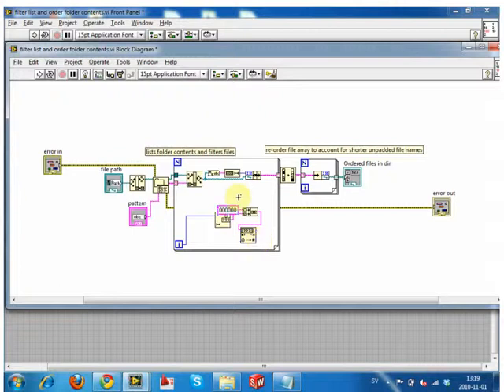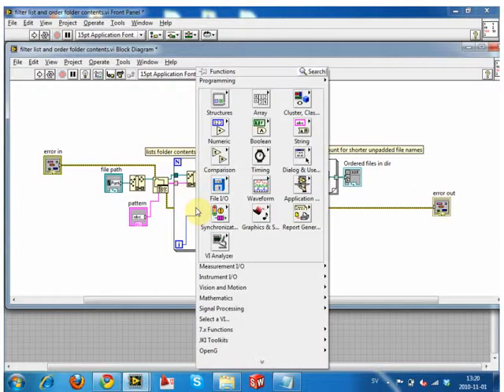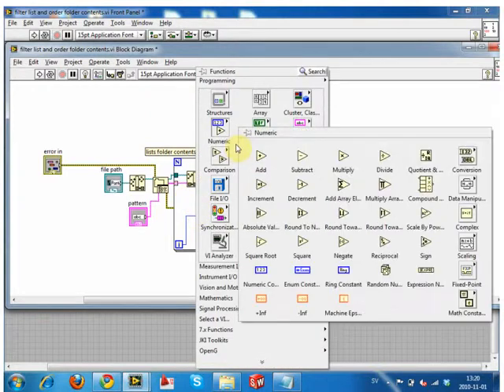When you have control over it, let's say we're analyzing the data sets of Selene or anybody else, and what you're actually doing is rewriting the data. So you're extracting things from the data and you want to save the images. You still want to use the same kind of zero padding system, but rather than inputting an arbitrary number, we measure how many files there are. Then, based on the string length, let's say it says there's 300 files. We can use a little thing that measures the string length. So it says, okay, the number 300 has a string length of 3. The first character is 3, and then there's a 0 and a 0. So it'll say 3, and then you can feed that number straight into here.